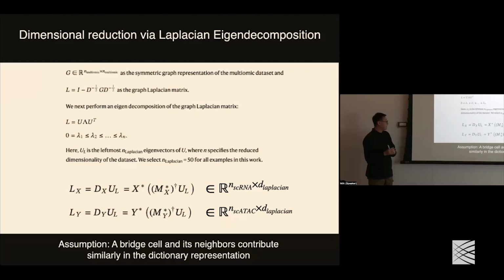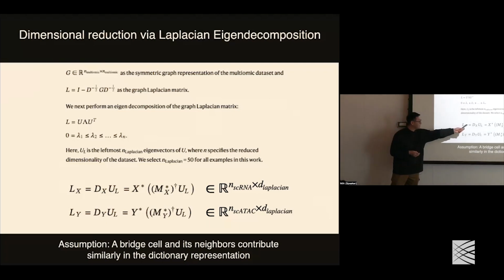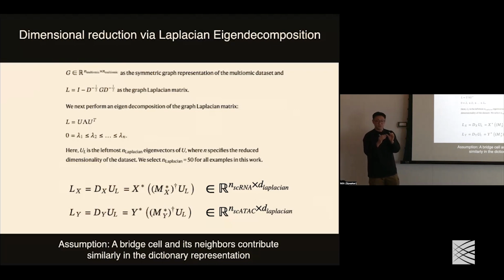But like I mentioned, the key thing we try to do is group the cells together. So we think, how can we find a low dimensional representation to represent those neighbor structures, those similarities? Then we realize this one is better because we don't care much about the variance in those cell similarity graphs.